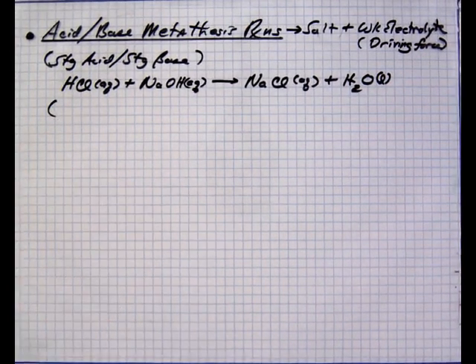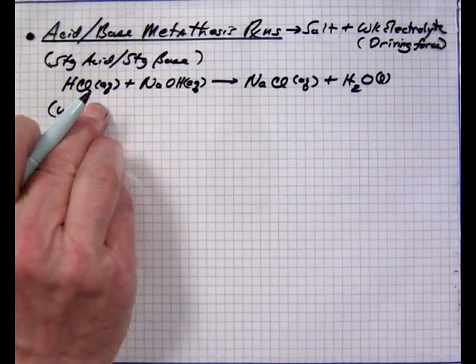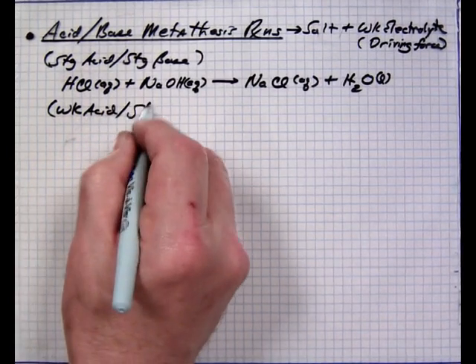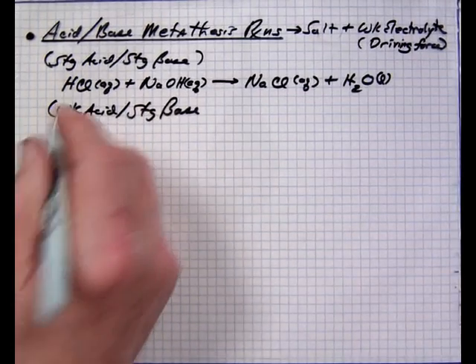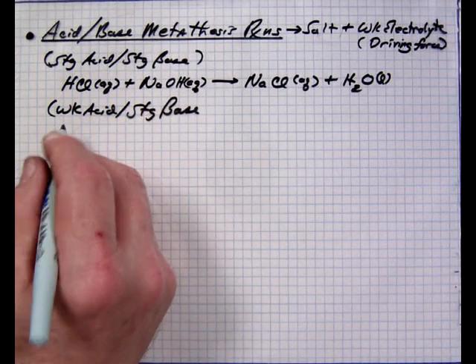Next, we look at a weak acid example and a strong base, where the weak acid in one solution is added into a base solution.